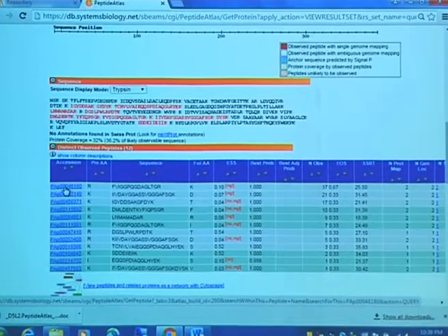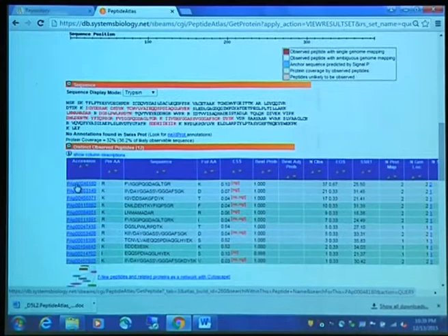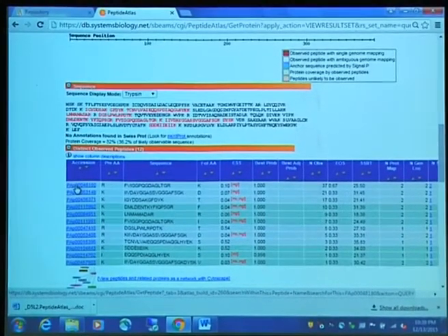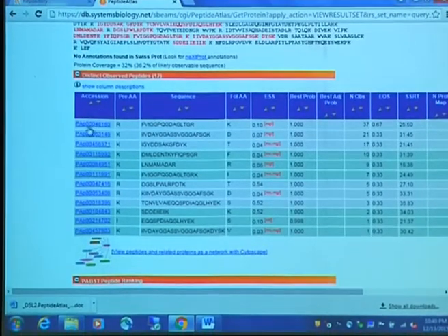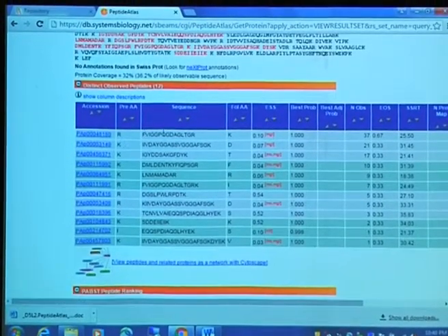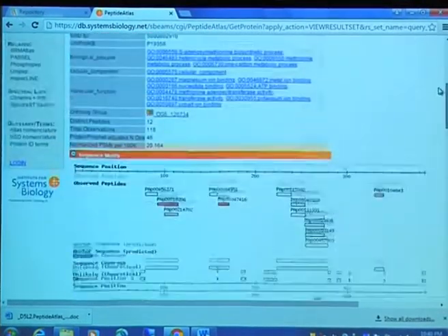So I'm not seeing the peptide in the instruction, so I'm going to deviate from that. Does everyone see this 48180? Are we okay to click that? So again, here is the accession number, here is the sequence, and I've gone down the page, and I'll do this thing where I close off the sections.